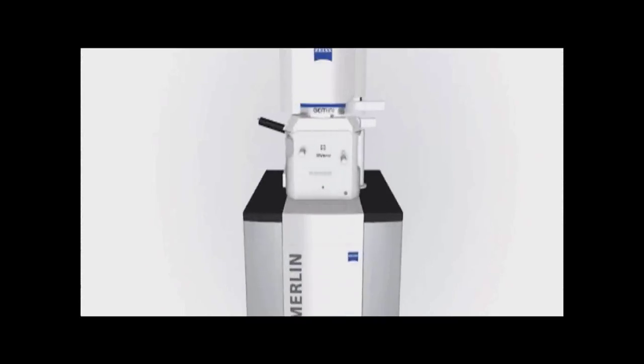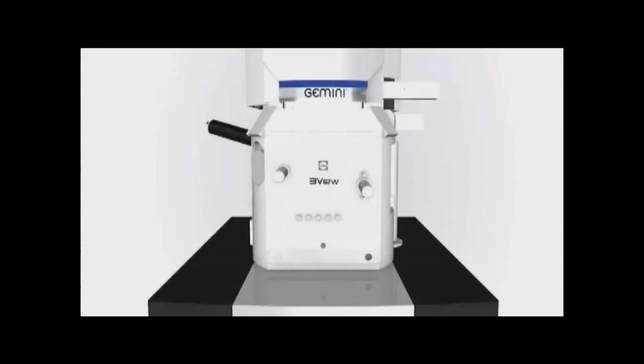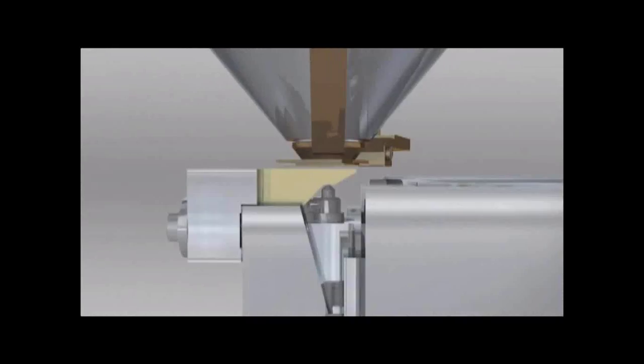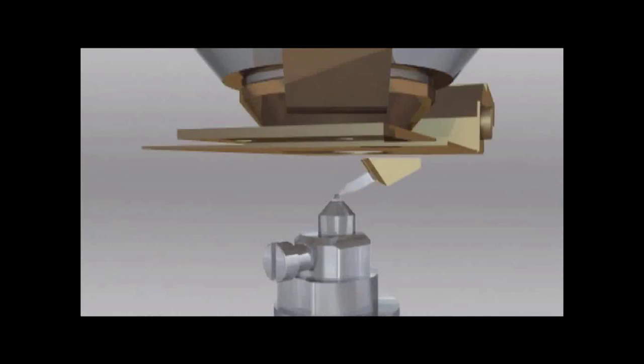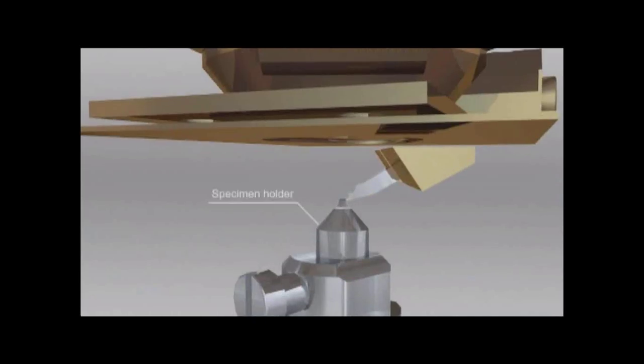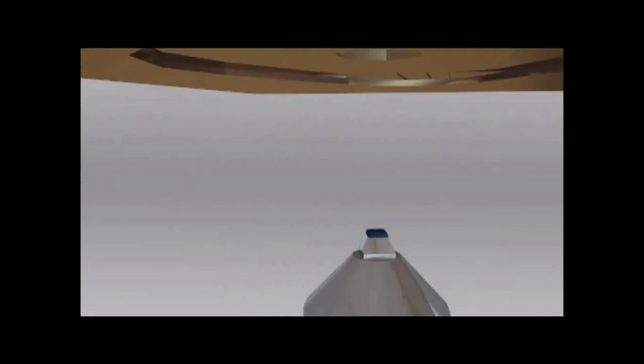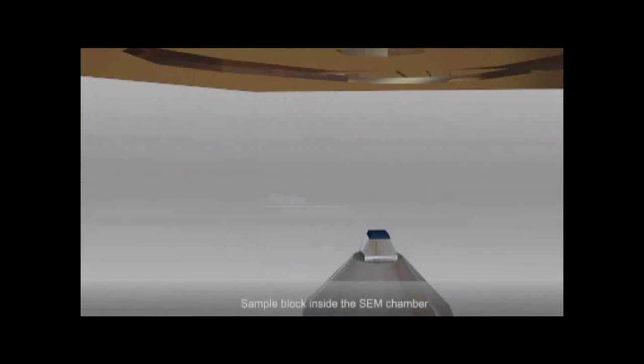So this is just a quick movie giving you a general feel of what the instrument looks like. We started out zooming out, showing an SEM, and SEMs are a little bit easier and more straightforward to use than a TEM. We replaced the door of the SEM with the 3View. So the 3View has its own door, and on that door is mounted a microtome. That microtome is equipped with a diamond knife, which shaves the surface. And here we've just cut the surface of the sample.